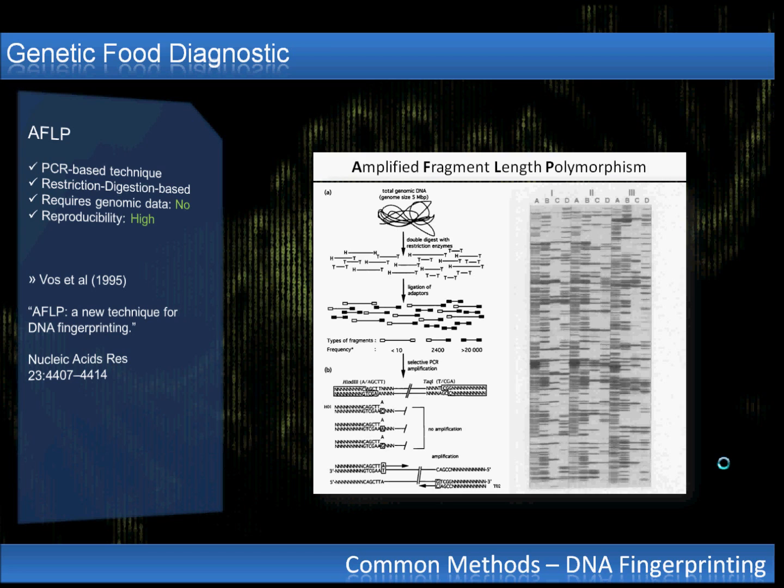for primer design, to use primers, and you can amplify from a big pool of fragments of different sizes. So you can amplify a specific group by extending the primer, so this extension reaches into the unknown of the fragment, and by doing that you get these fingerprints which you can see on the right side, and by choosing more and more extension you get a clearer picture of the fingerprint, less fragments.